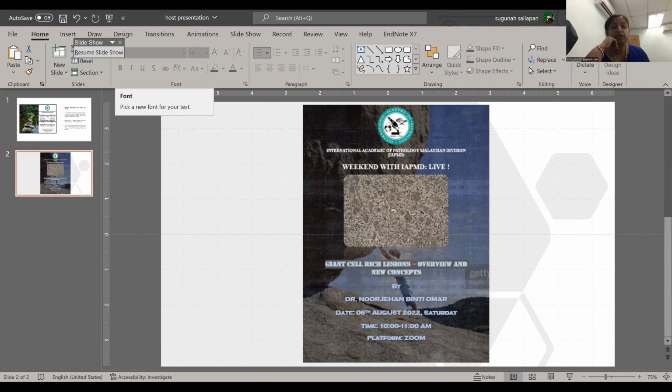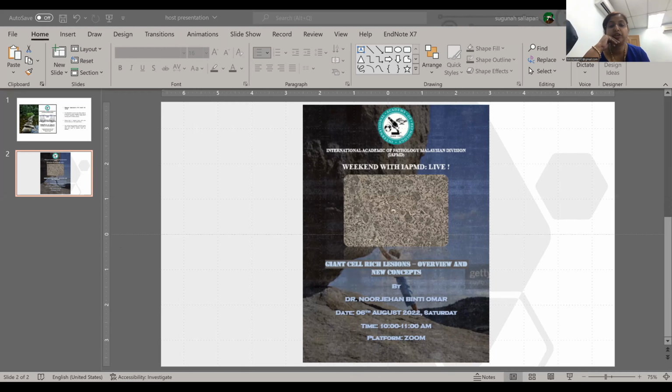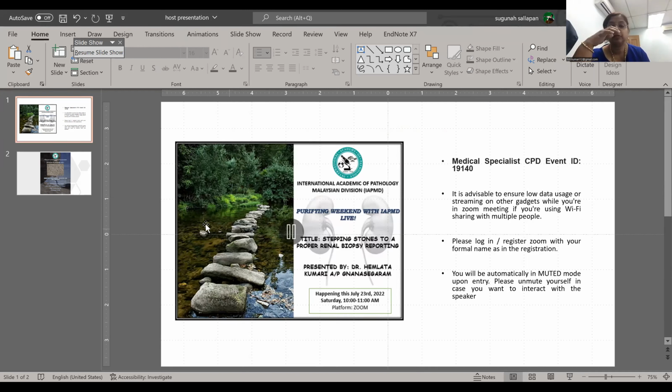Yeah, true. I totally agree with you, Heidi, because many a time, people make mistakes when your staining is not done properly. Let's say your tissue is too thick or your staining is inadequate, and you can miss even simple things like membranous GN. You don't see the proper silver staining, you don't see the proper MT staining, and then you miss the diagnosis.